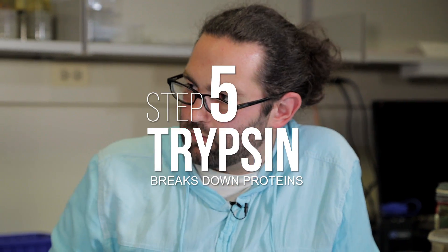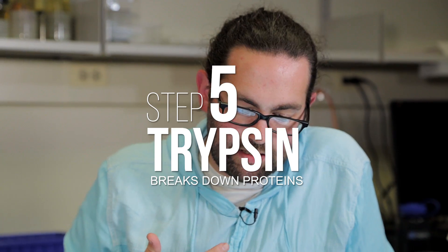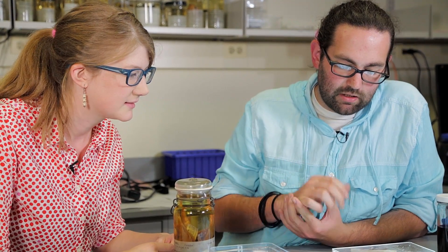For the clearing — to clear away the tissue — we use trypsin, which is an enzyme that digests proteins. It's found commonly in vertebrate digestive tracts. Trypsin eats away at the tissue proteins but leaves the collagen.